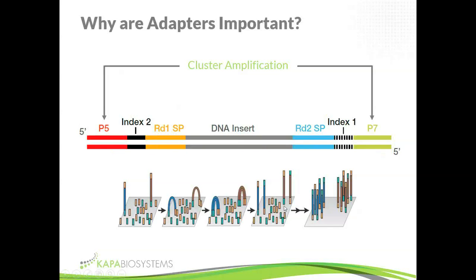And so by the time that you want to sequence your library, the adapter has to be completed. You don't have to add all these sequences in one shot. In most Illumina library construction protocols we do, but you can also build this adapter bit by bit. The important thing though is, by the time you're ready to sequence, all these functional elements have to be there.